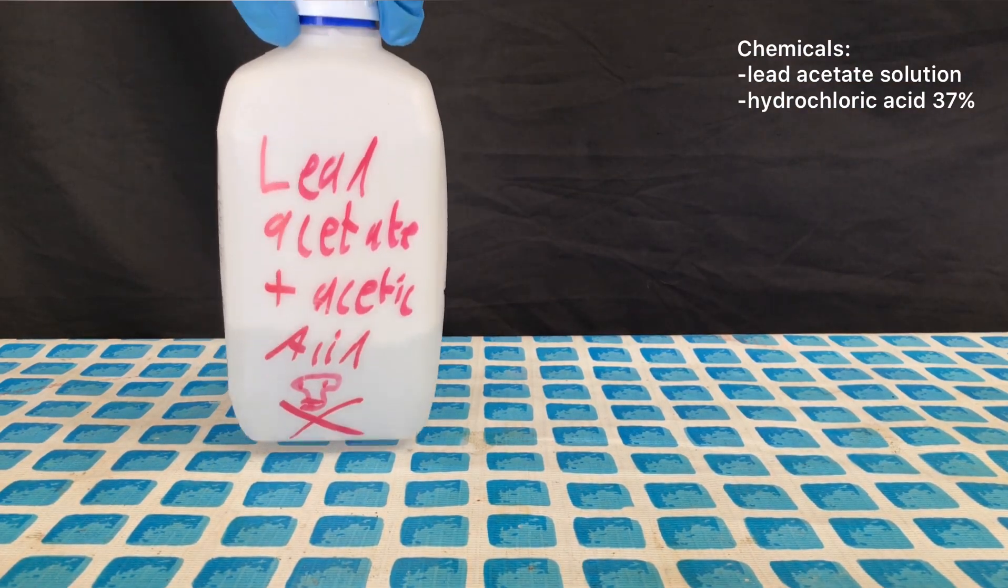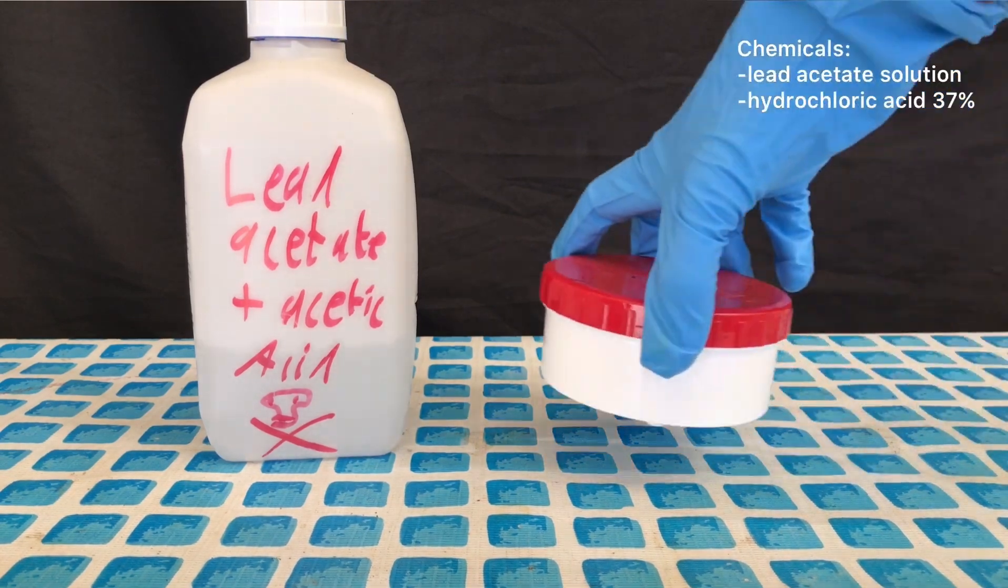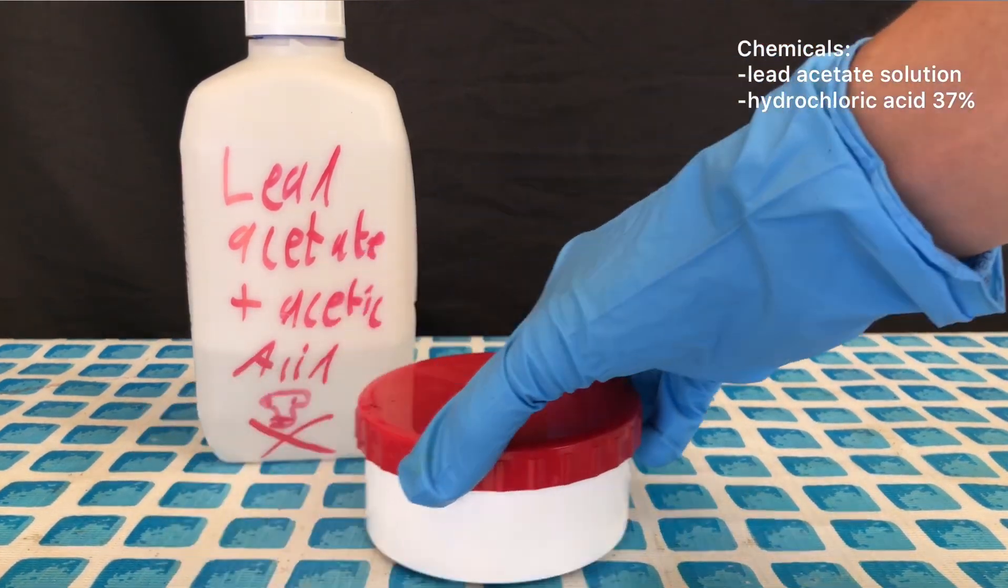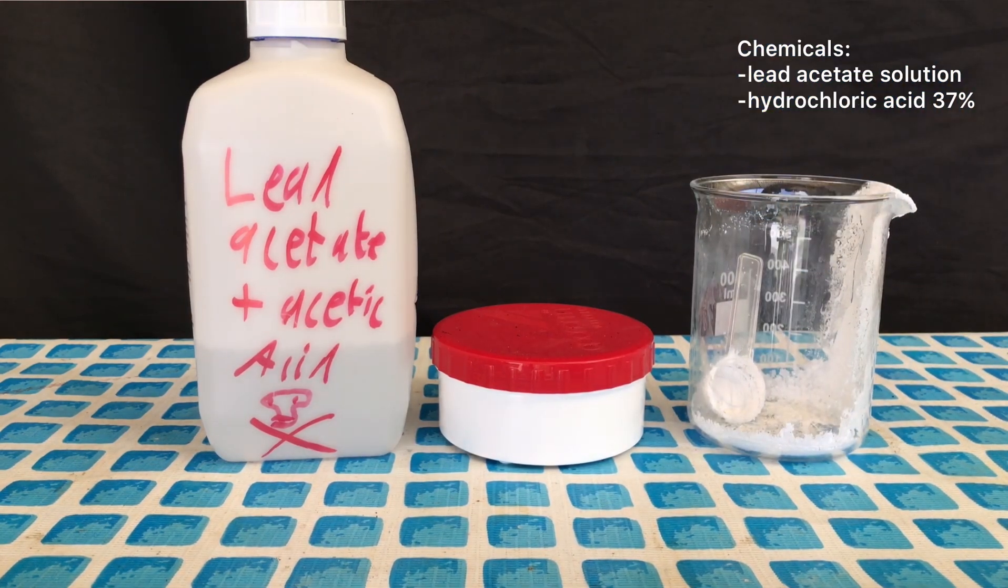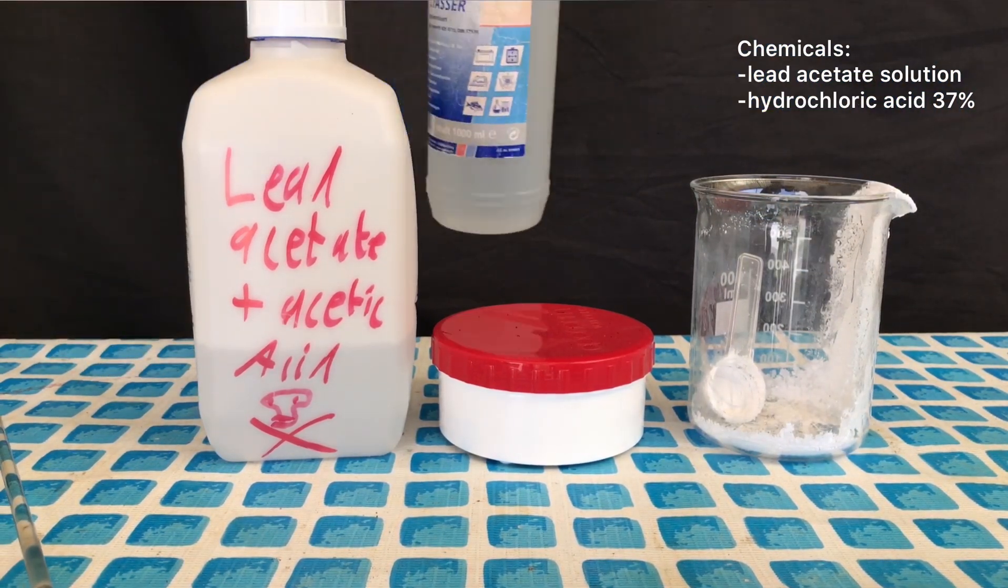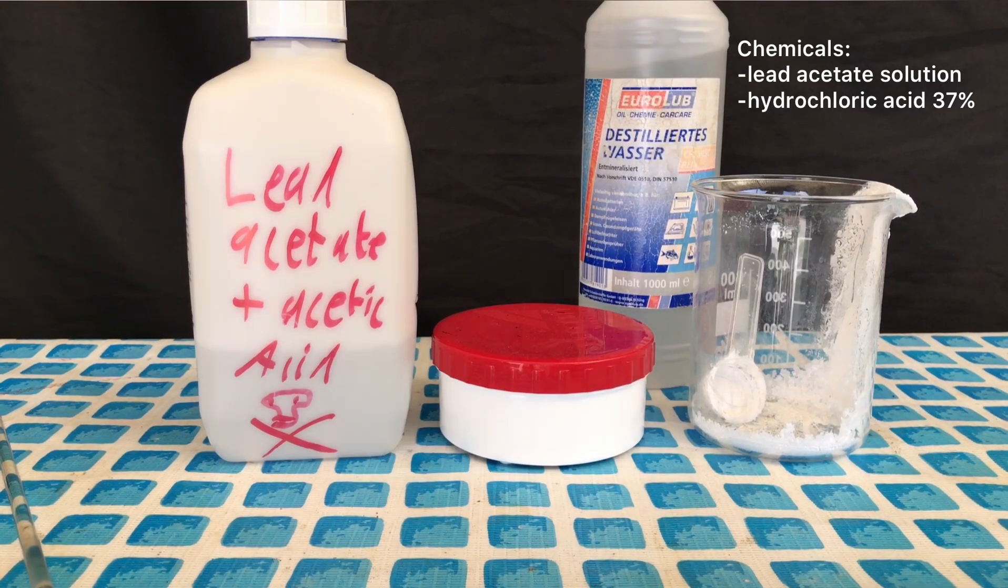Today we are going to make some lead(II) chloride from lead acetate and lead acetate solution. All of these here are basically waste material and I don't want to deal with it anymore. Therefore I am going to recover the lead in the form of a poorly soluble lead salt.